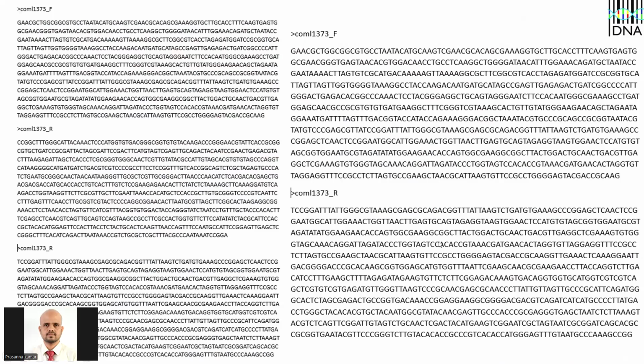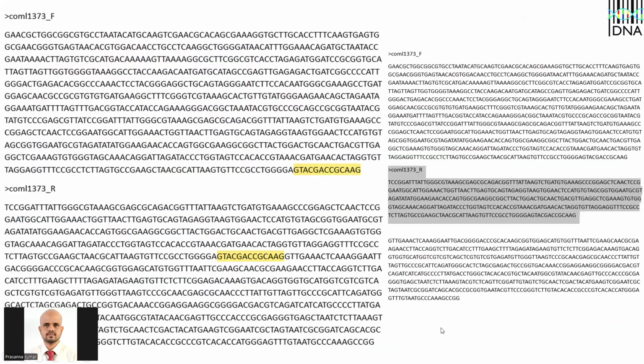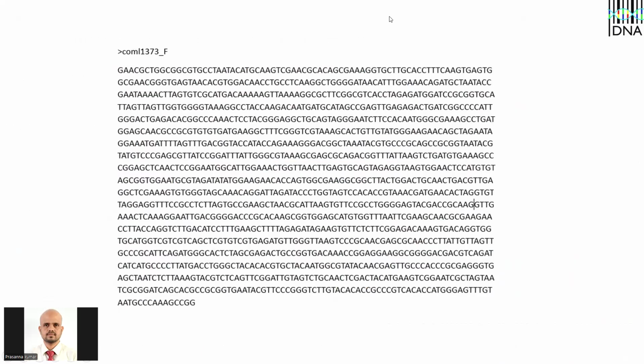So you will have a forward sequence and reverse complement. In the Word file, take the last 10 or 12 nucleotides of the forward, press Control F, and find it. It will be here. From here, leave till AAG, and from here, GTT. I have trimmed it, delete this. Now merge the sequence. Okay, that's how the forward and reverse are merged.